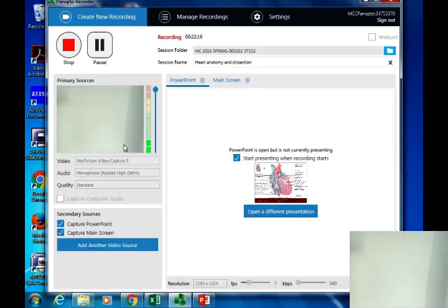With some of the different parts that you're dissecting, when they cut them out, a lot of times they're cutting out a lot of the major blood vessels off the base, and sometimes they may even cut it as low as removing some of the atria. But it does give you a very neat view down into the different valves as well as blood vessels. So do what you can with the way that you're receiving it, but sometimes it's actually a boon because you can actually see more interesting things than you thought you would.